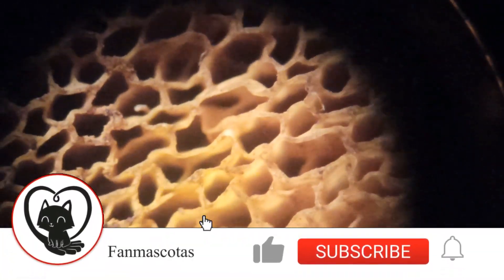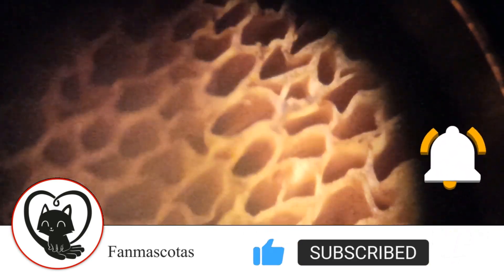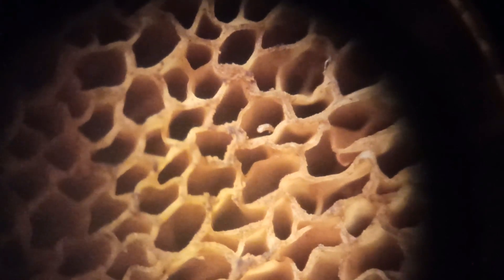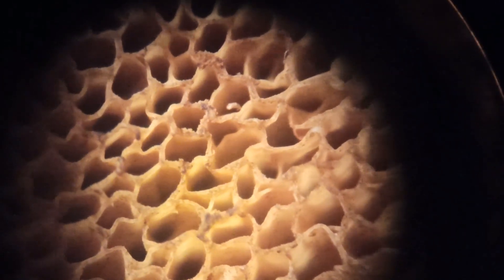So we're going to go see these pores. The pores are coming out, we're going to see them. Now I'm going to put it on 2, now on 4, on 40.